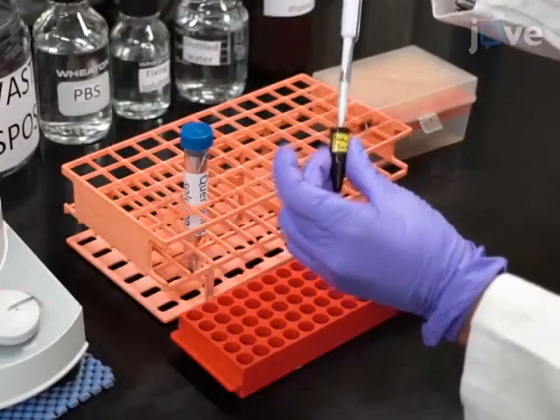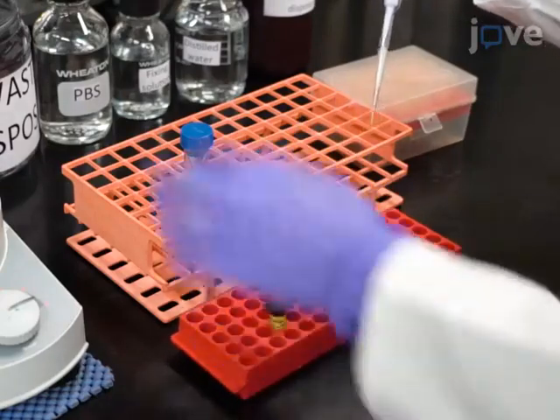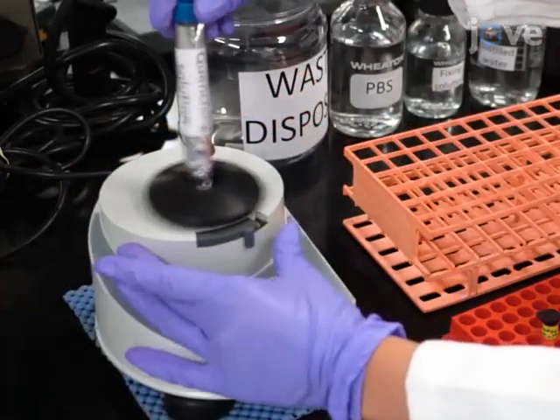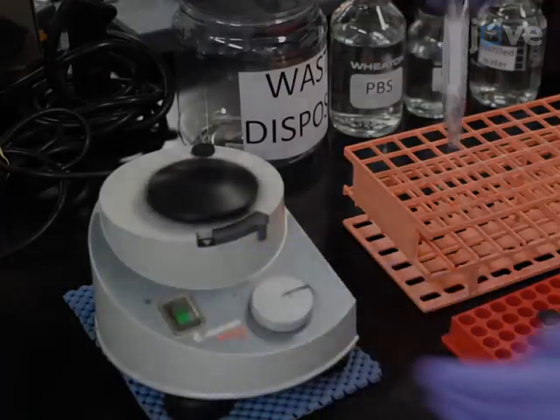Prepare a 5-micromolar BODIPY quenching solution for the lipid fluorescence recovery, or LFR assay, by adding 1 microliter of 10-millimolar BODIPY 493/503 to 2 milliliters of 500-millimolar quenching solution.